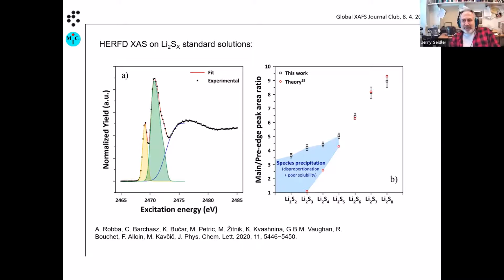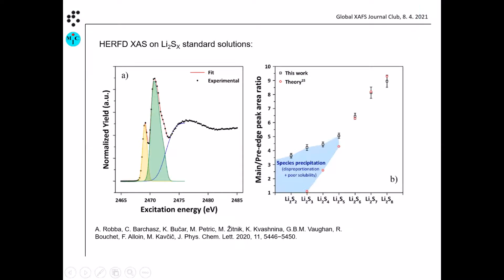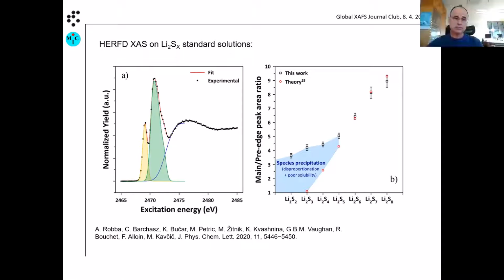Very good. All right. People should keep putting their questions into the chat. So to begin, Konstantin, you had a question? Yeah, thank you. First I want to ask instrumental questions, and then at the end, I think, a more general discussion about double excitation. But on the instrumental side, in the Johansson spectrometer, in this square-shaped geometry, the detector was position sensitive, I guess.